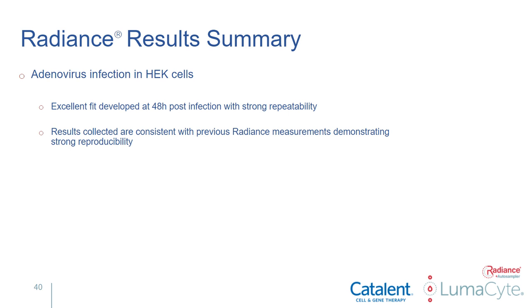To summarize the results from this adenovirus infection experiment, we did get an excellent fit at the 48-hour post-infection with strong repeatability. And the results that we collected were consistent with the previous Radiance measurements and thus demonstrating strong reproducibility.